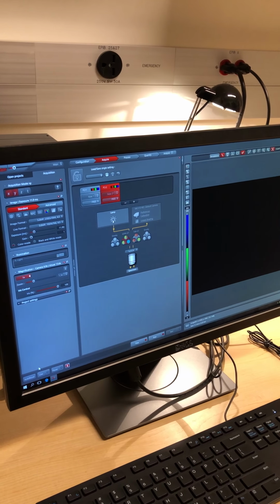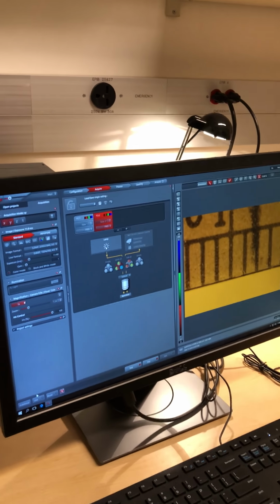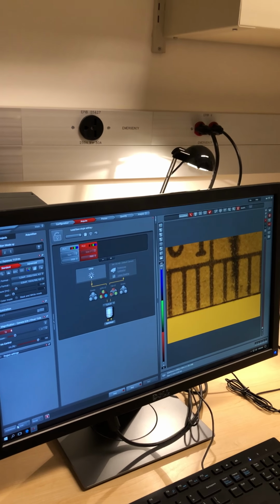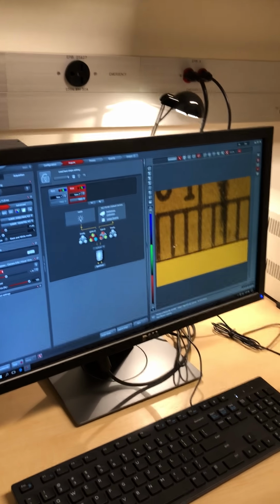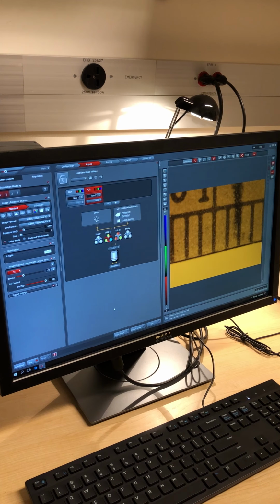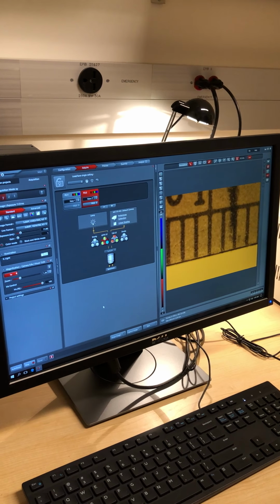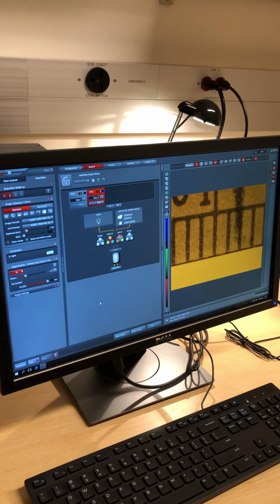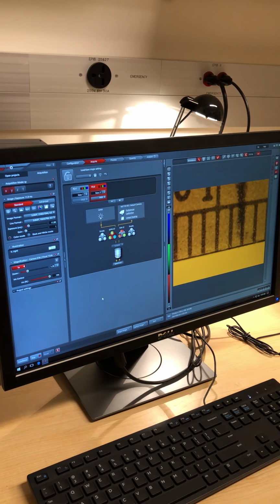Okay, so a few things. Autofocus button. Sorry, where was the autofocus button? Here. Okay, so basically, it's going to do a little Z-stack to find the focal position where it thinks everything's in focus. That's great for something fairly planar, but what about something with three-dimensionality, like a worm? You can do it, I'll show you how. That's where EDOF comes into play. Extended depth of field.